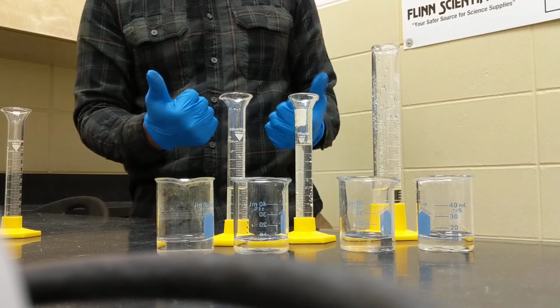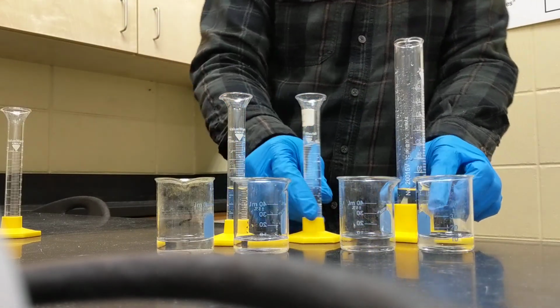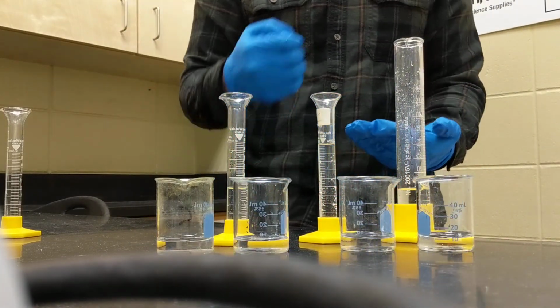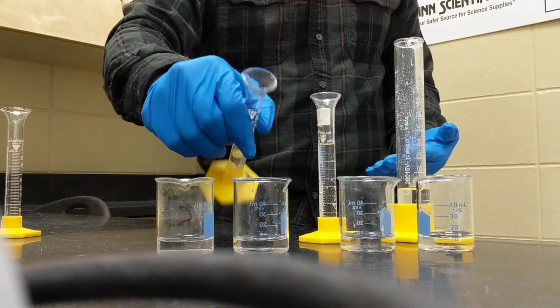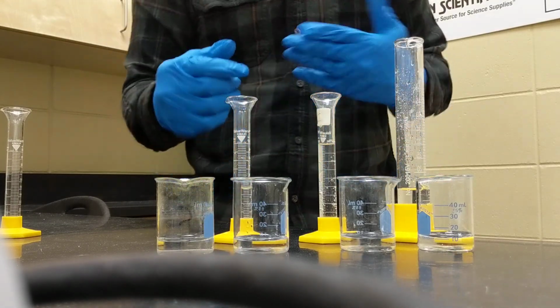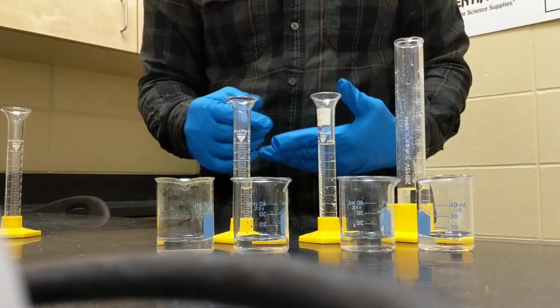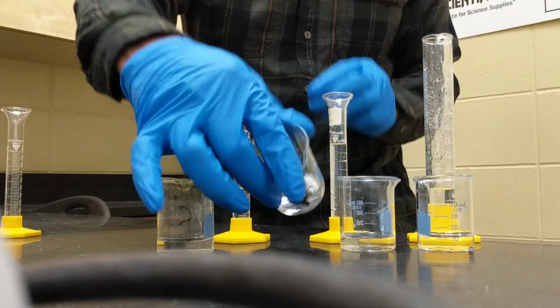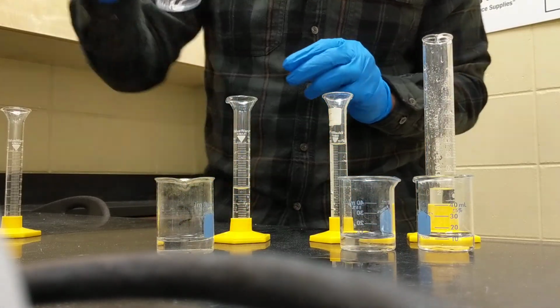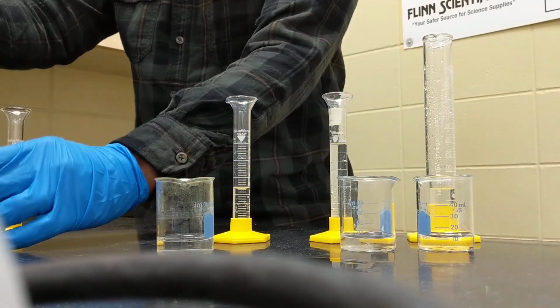Now, when you're doing this experiment, you want to time it. So you may not want to do all of them at once. When you're measuring the experiment, you measure it from the addition of the sodium thiosulfate to the hydrochloric acid to when it actually becomes cloudy and opaque to the point where you cannot see the black mark on the bottom of the beaker, which, sorry, I made a mess.